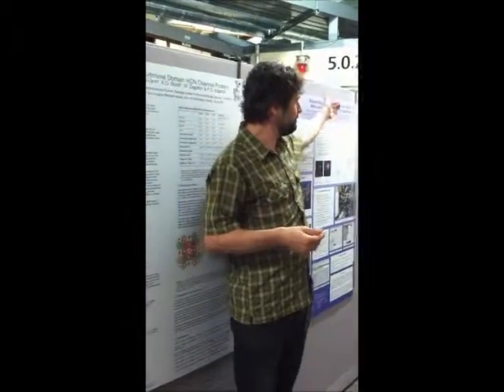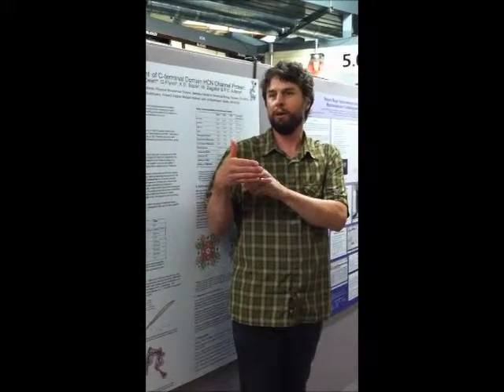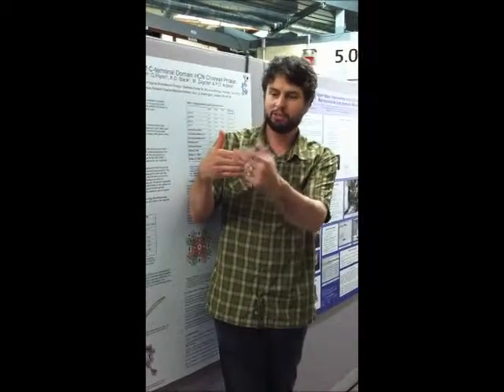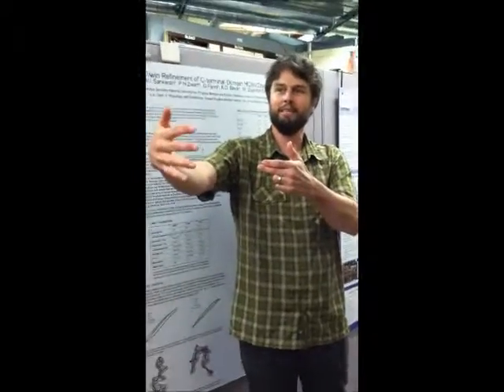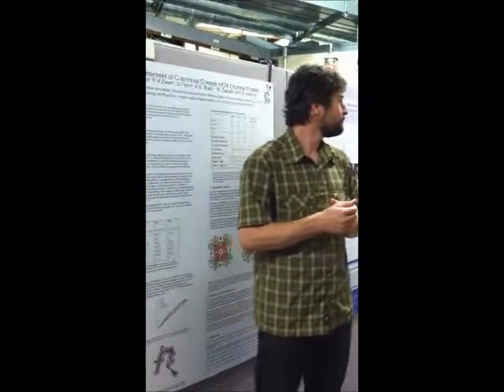So basically the beamlines come into here, and at the end of the beamline there's a beryllium window. Beryllium is transparent to X-rays, and that separates the vacuum on one side from the ambient atmosphere on the other. And then they put the protein crystal right downstream of that and take the exposures. Well, I should say the protein crystal, and then a really, really fancy CCD camera that costs $500,000 downstream of that. That's how they collect the actual image.